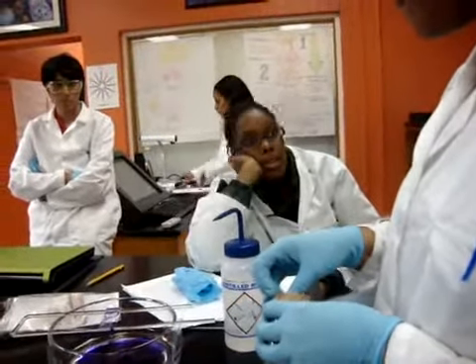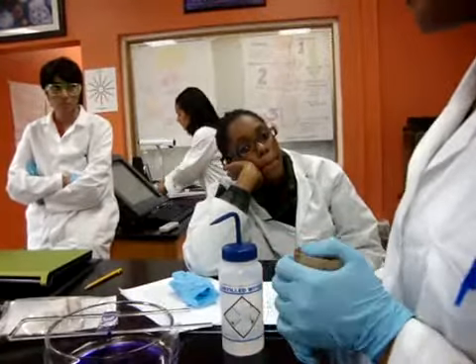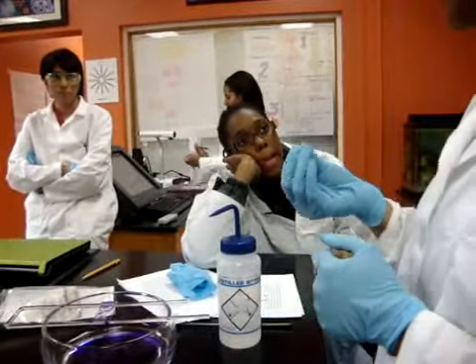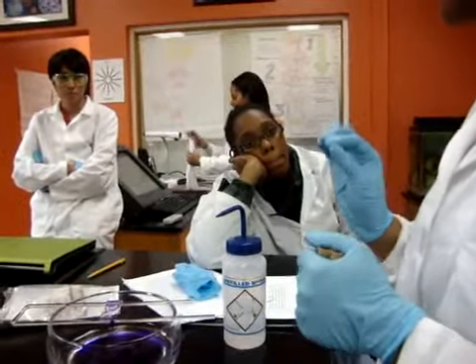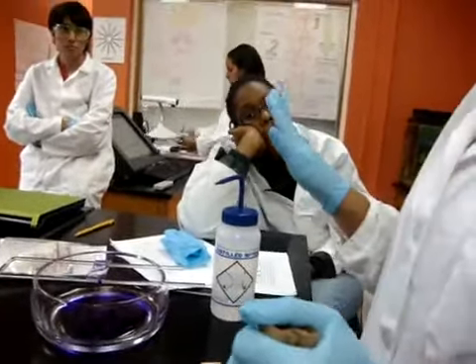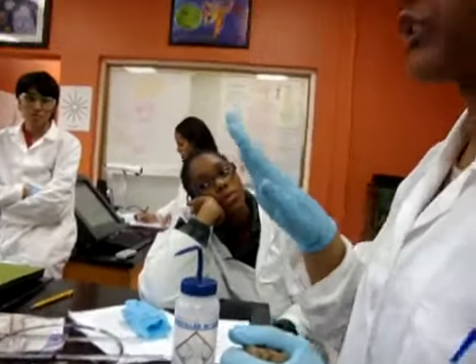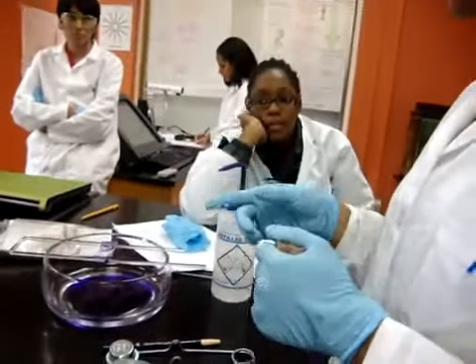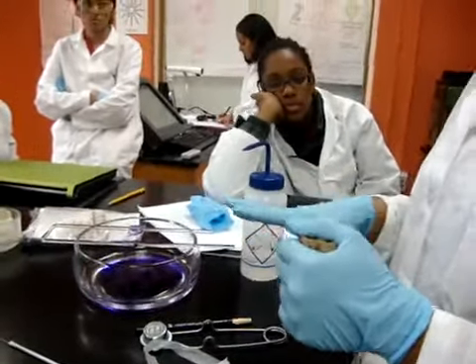It depends how much bacteria you put on there. Because if you smeared it with a lot of bacteria, the bacteria is going to hold the stain. So you might see a little bit of purple, but your circle should not be completely purple. You should still be able to see through it. It should be transparent. Okay. And then you just go into the next iodine, ethanol, safranin, doing the same thing, remembering to try not to wash the smear completely away.